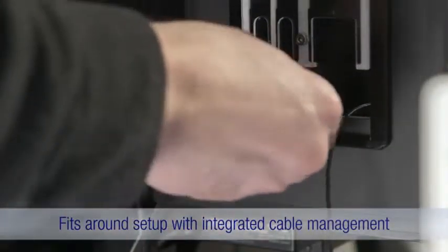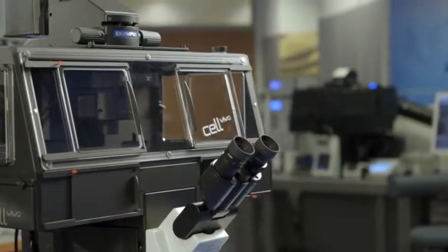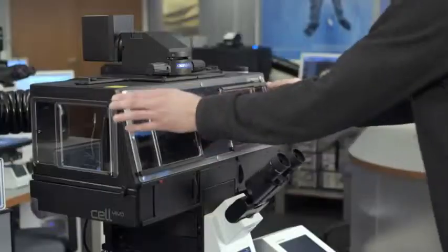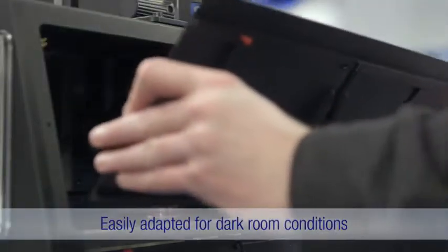Guiding the cables through the dedicated window, the system can even be attached without dismantling the experimental setup. Thanks to exchangeable light shielding modules, the Cell Vivo incubator can also be easily adapted to dark room conditions.